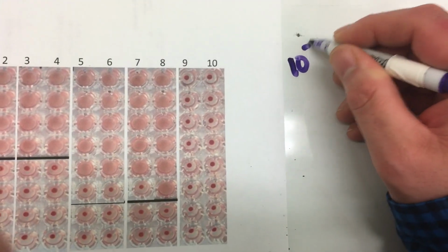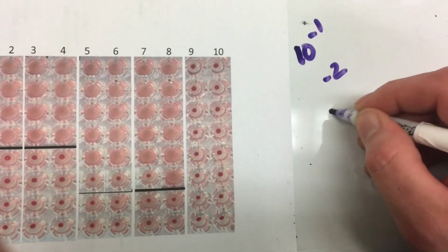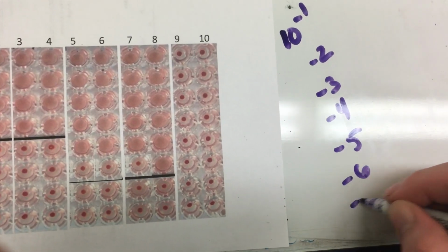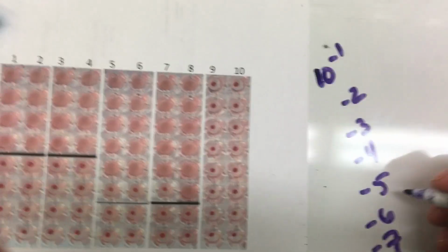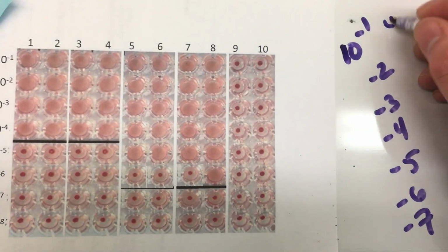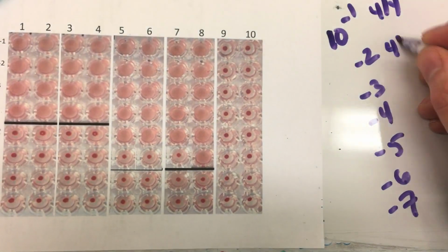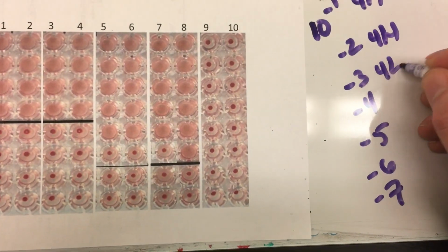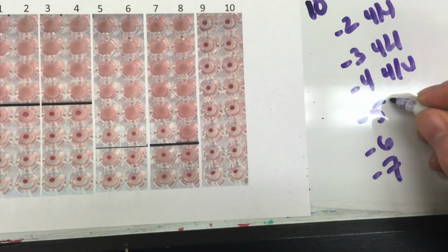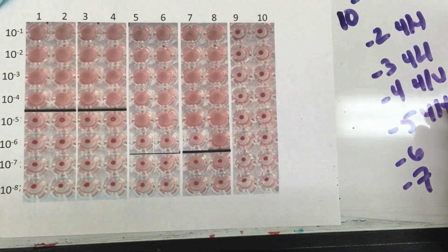So going back, we have 10 to the negative 1, negative 2, negative 3, negative 4, negative 5, negative 6, negative 7. Okay? At negative 1, we have 4 out of 4. Negative 2, 4 out of 4. Negative 3, 4 out of 4. Negative 4, 4 out of 4. Negative 5, 4 out of 4.